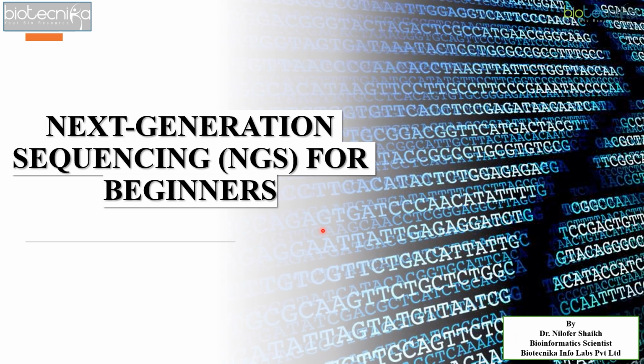Today we are going to have an overview of what is meant by NGS, that is next generation sequencing. As a beginner, what are the important points we all have to remember so that we will get more insights about the technique called the next generation high throughput technique and how it can be used for research based applications.